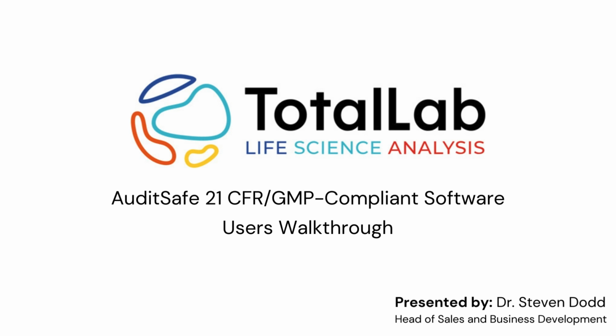Hello everyone. So today I'm going to be guiding you through the user creation and permission assignment process within our AuditSafe software.